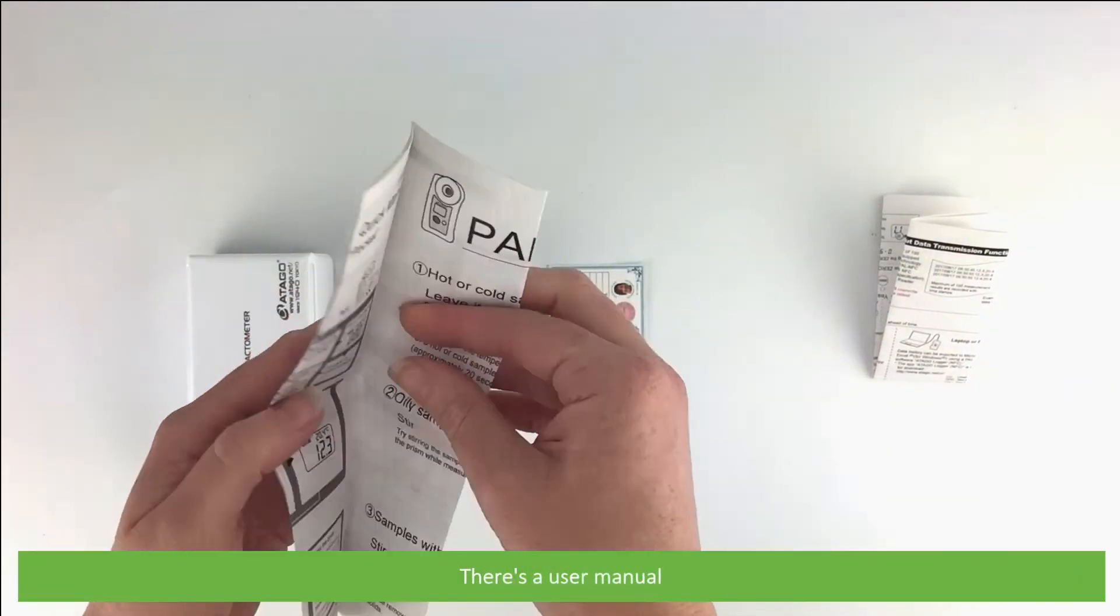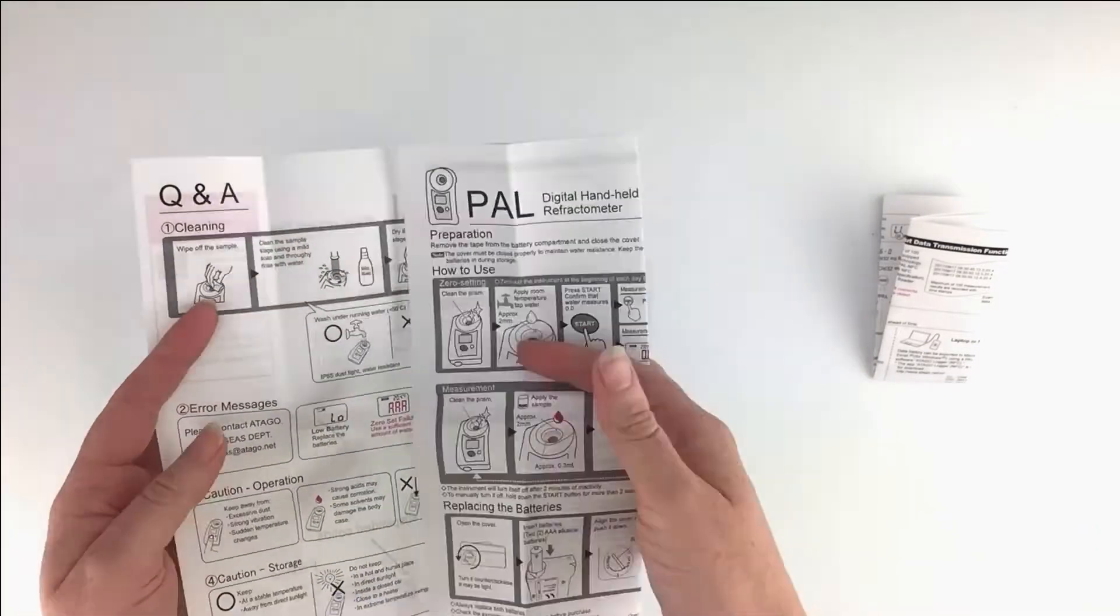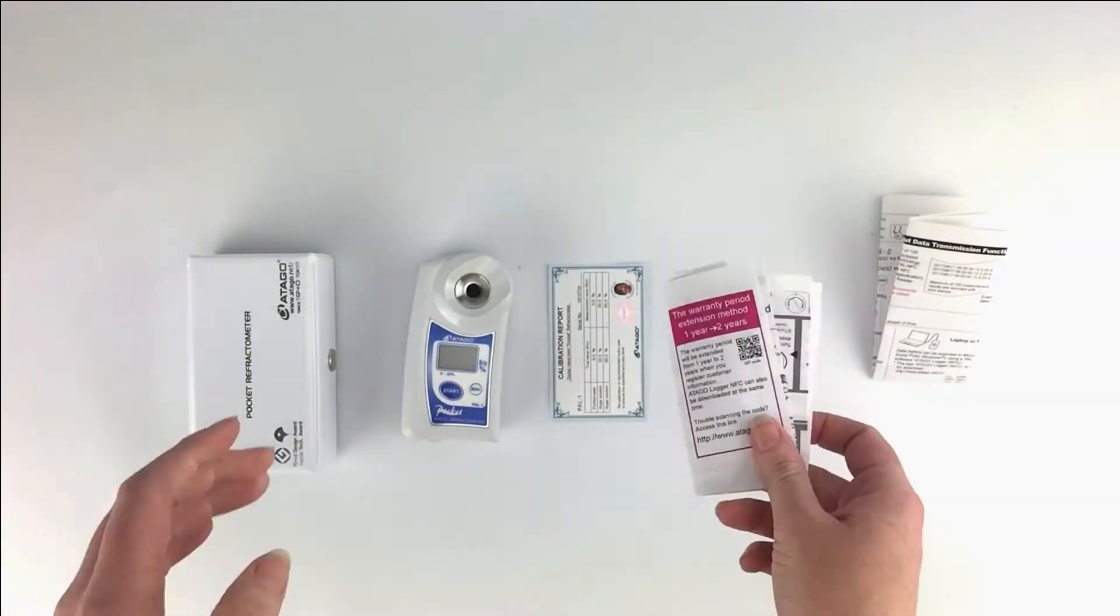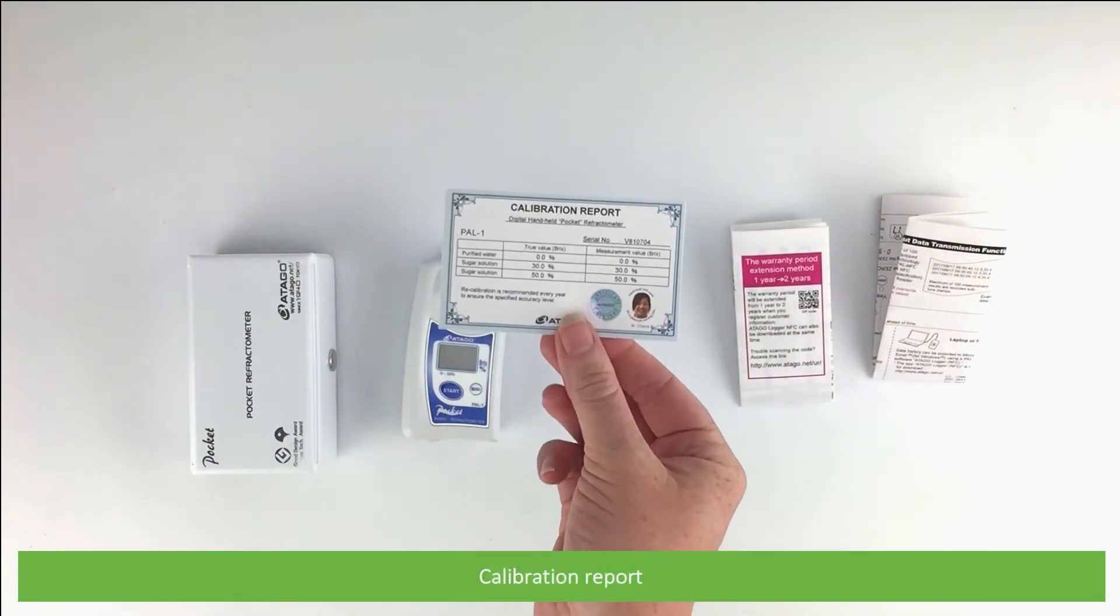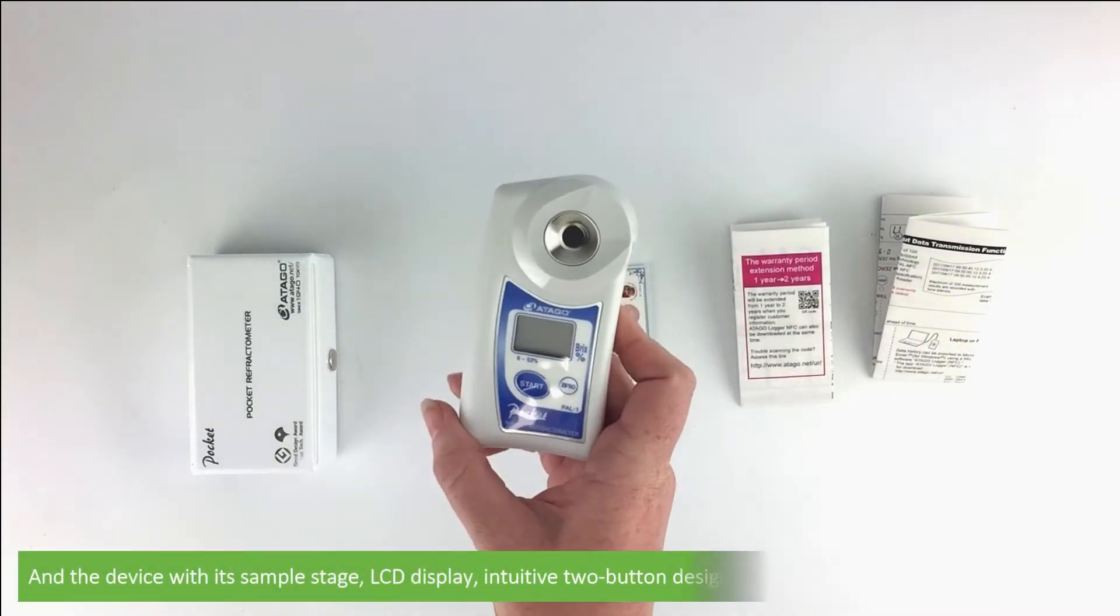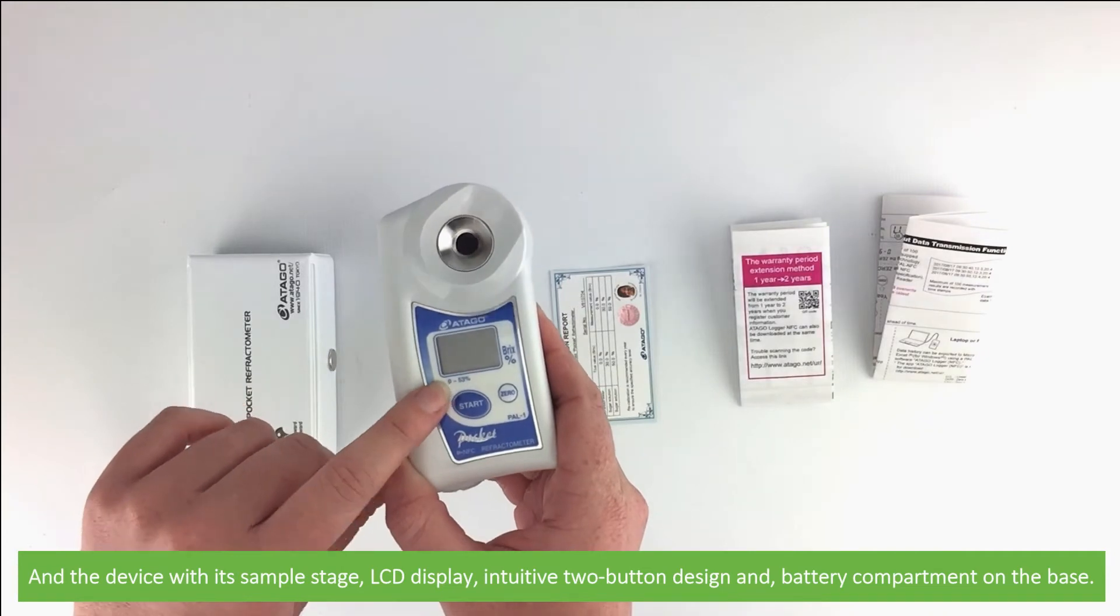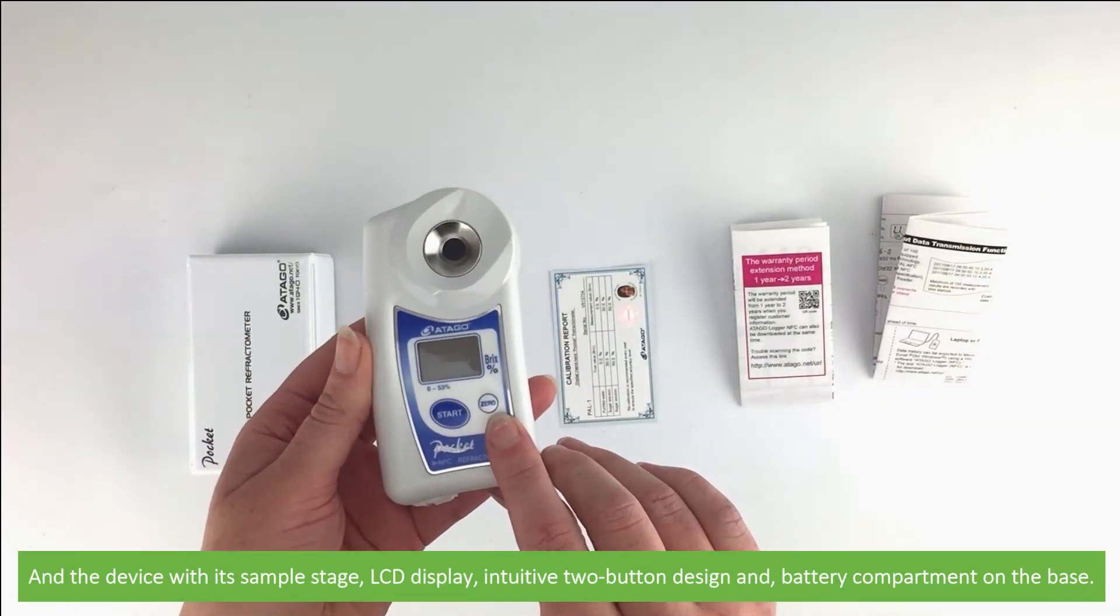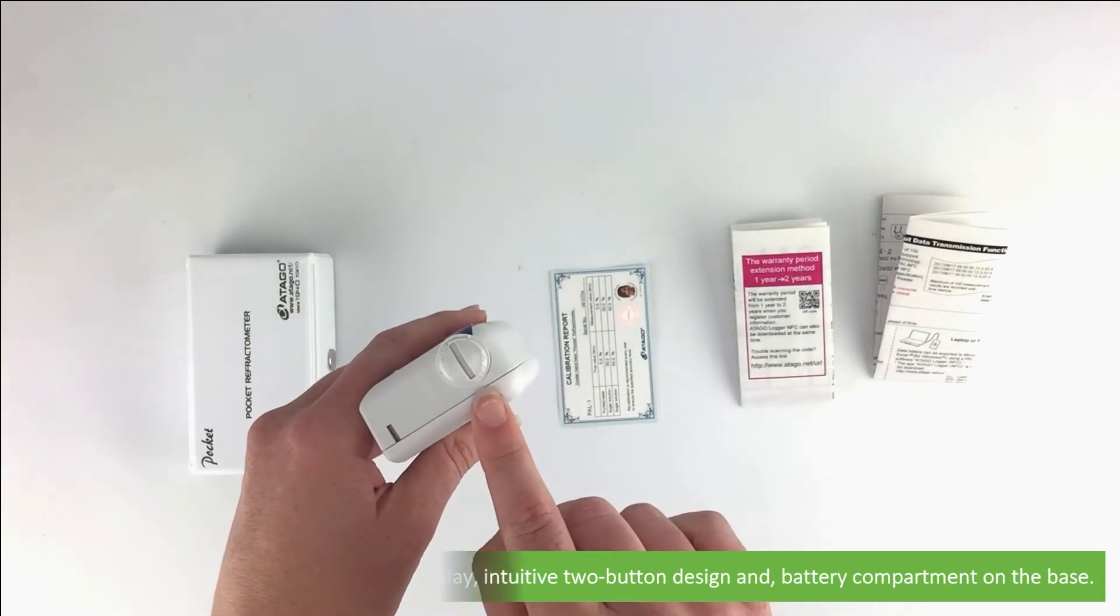There's a user manual, calibration report, and the device with its sample stage, LCD display, intuitive two-button design, and battery compartment on the base.